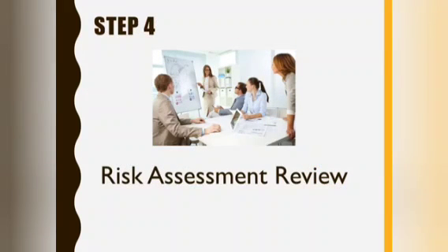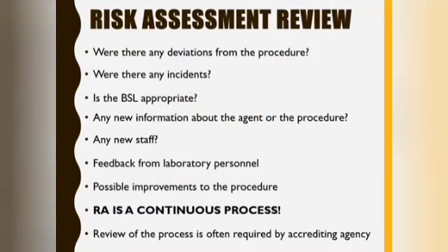Step 4. Risk Assessment Review. Points to be considered in risk assessment review. Were there any deviations from the procedure? Were there any incidents? Is the biosafety level appropriate? Is there any new information about the agent or the procedure? Are there any new staff? Feedback from laboratory personnel? Possible improvements to the procedure?